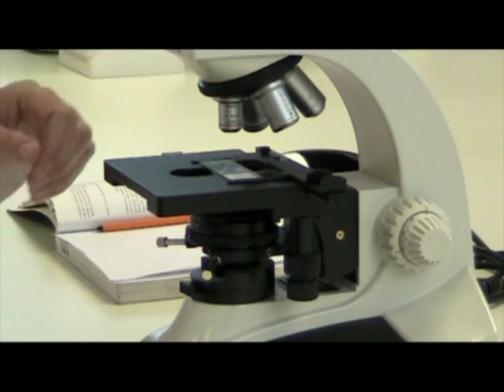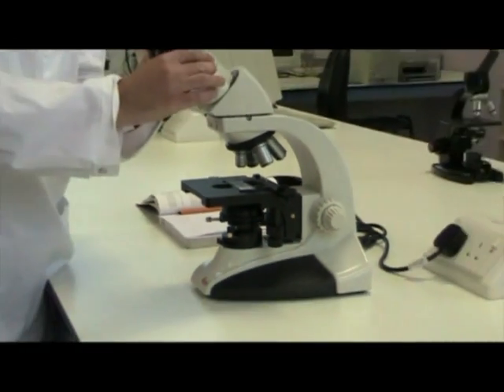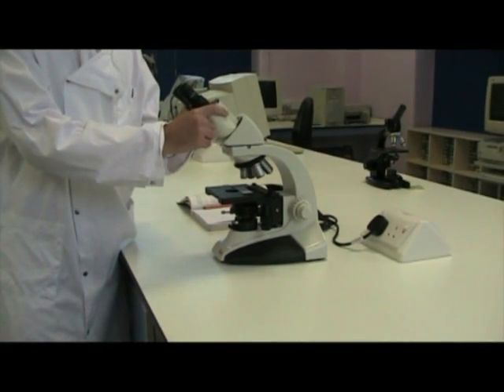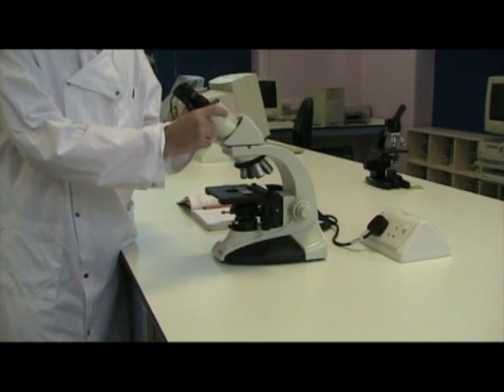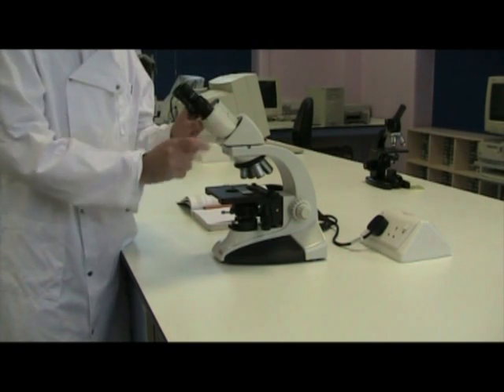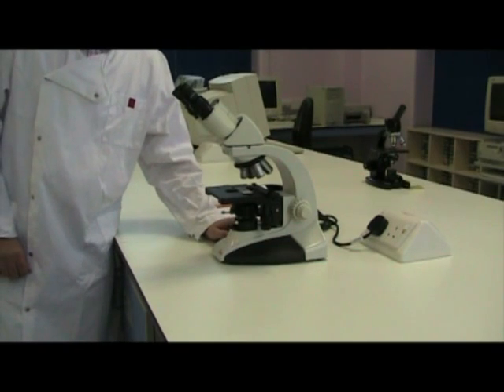The next thing we need to do is set the eye distance on the binocular piece of the microscope. This should be the distance between your eyes. And then we're ready to turn the microscope on.